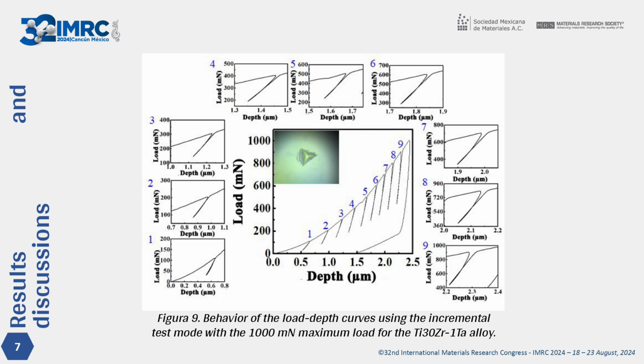The discrepancy between the unloading and reloading paths is slightly amplified with increasing depth, as evidenced by the augmented applied load of the indentation. As indicated in the literature, the open loop suggests that the sample exhibited greater ductility during reloading than during the preceding unloading phase. This observation may be attributed to creep of the material due to plastic deformation.